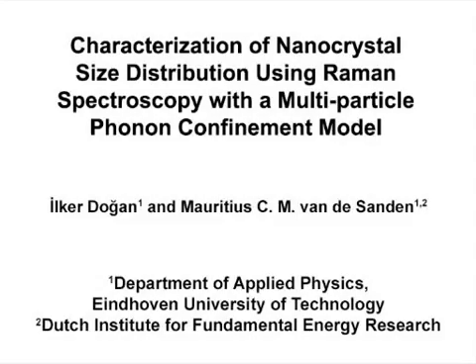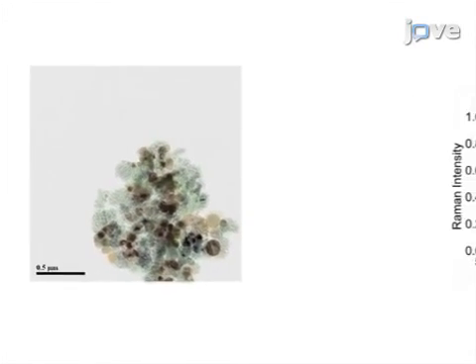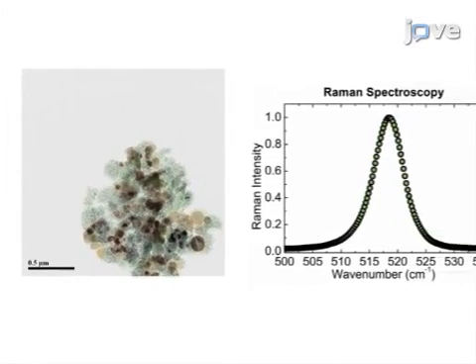The overall goal of this procedure is to use Raman spectroscopy to determine the nanoparticle size distribution in a fast, reliable, and non-destructive way. This is accomplished by first acquiring the Raman spectrum of nanoparticles of interest.